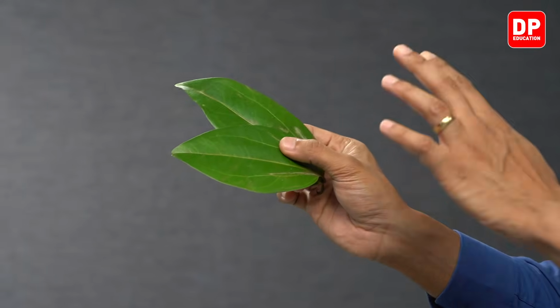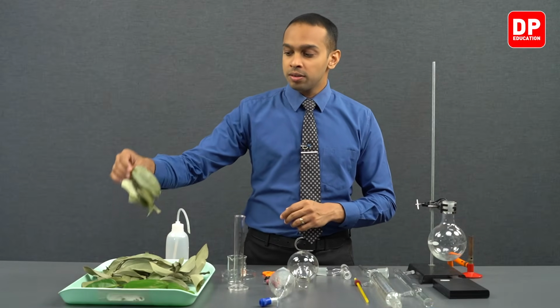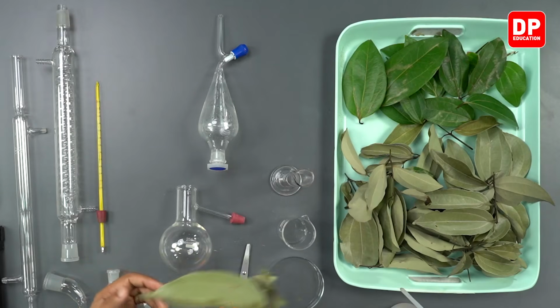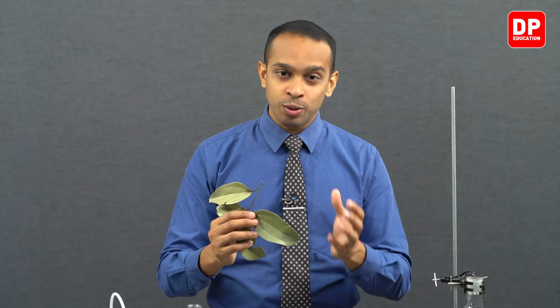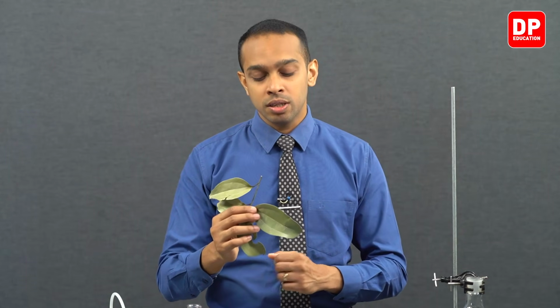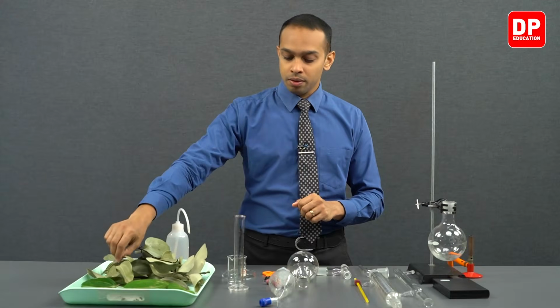These are raw cinnamon leaves, and we have here cinnamon leaves that are dried. We will be using dried cinnamon leaves to make sure that we can extract the most amount of cinnamon leaf oil. So in this experiment, we will carry out the essential oil extraction process with the use of dried cinnamon leaves.